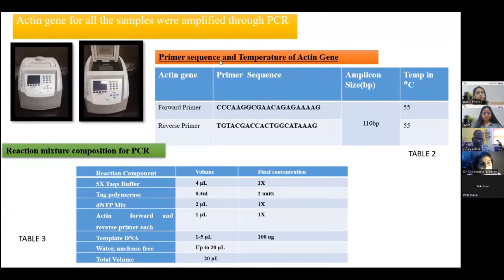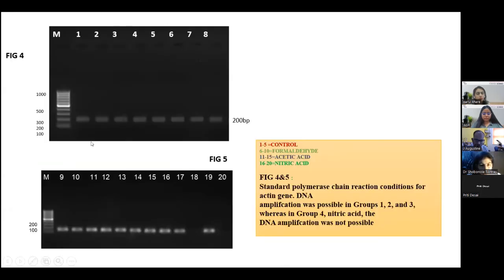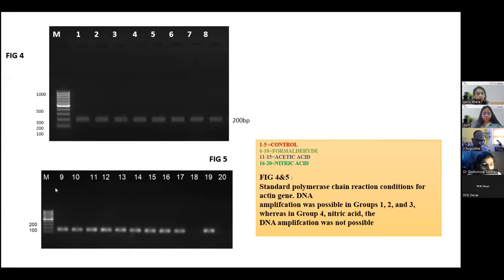Next, we performed amplification of the actin gene for all samples via PCR using specific primers and a PCR master mix. The final results for the actin gene, as seen in Figure 4, show clear bands from 100 to 1000 base pairs in Groups 1 and 2. The actin gene was present in the formaldehyde and acetic acid groups. However, in the nitric acid group, we could not detect the actin gene.